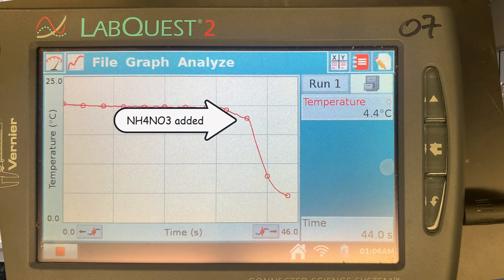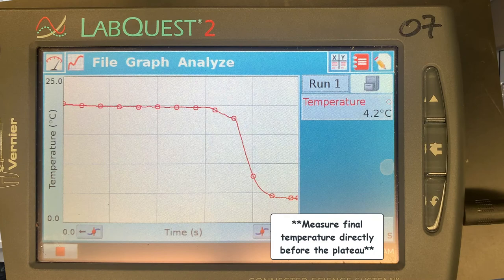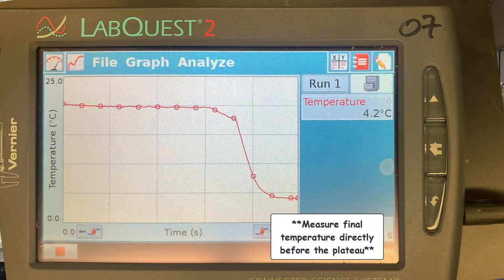As you can see on the graph, there is an immediate temperature drop. The final temperature of the reaction can be measured at 4.6 degrees.